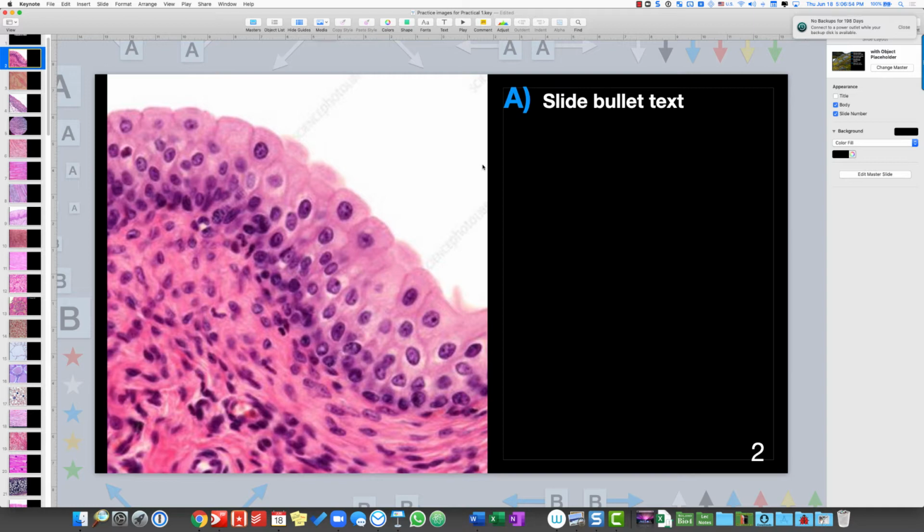Okay. Now if I say something like simple squamous, you should still understand that you are still responsible for putting the epithelium on test. Okay, simple squamous epithelium. Now let's begin. This is transitional epithelium, which we already talked about in class.